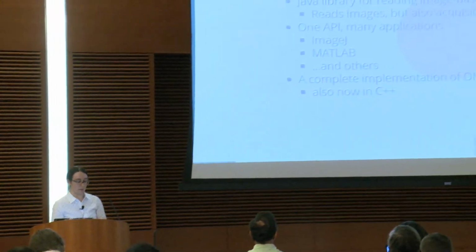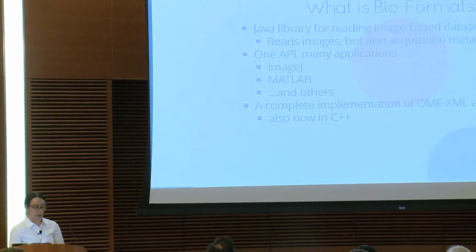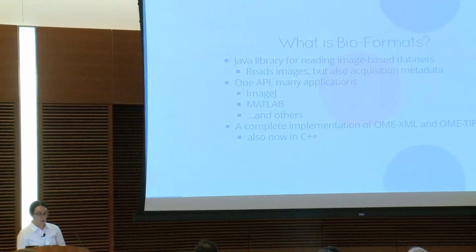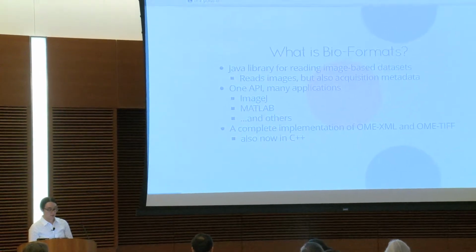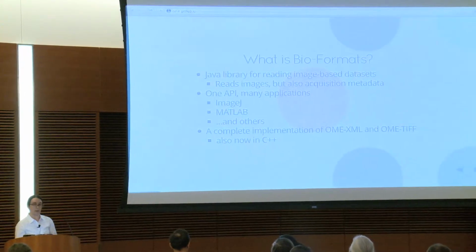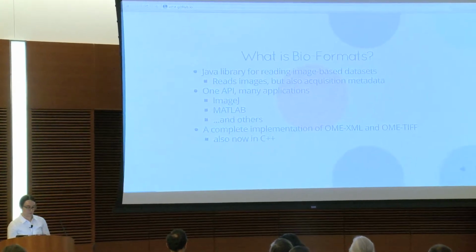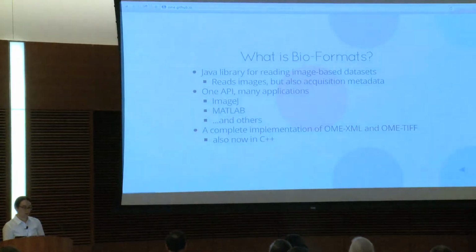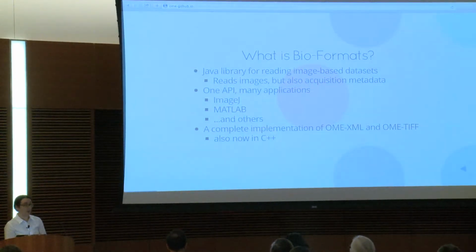To facilitate this, the OME group maintains a standardized schema for describing acquisition metadata called OME-XML, and a file format that uses OME-XML called OME-TIFF. Bio-Formats provides a complete reference implementation for both and uses the OME-XML schema internally for working with acquisition metadata. Over the last few months, we've also released a new C++ library which fully supports OME-XML and OME-TIFF, and that may be of interest to some of you who are writing software in C++.